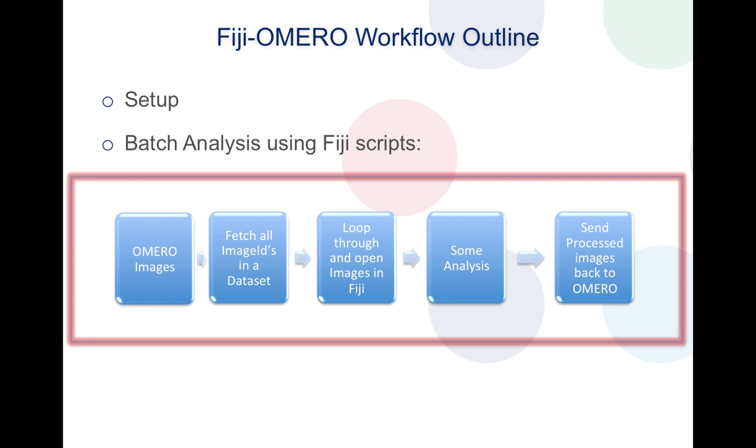What I'll be talking about is how to set this up and to run an example batch analysis script. The workflow will be pretty straightforward where I'll be opening up a couple of OMERO images under an OMERO dataset, iteratively doing some analysis on these images using the Fiji image processing tools, and then eventually sending the processed images back to OMERO.